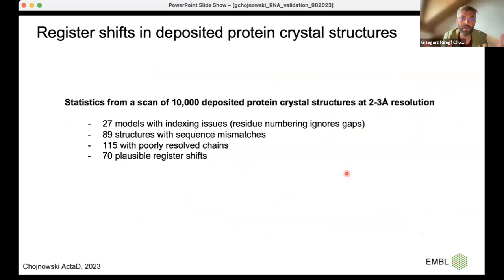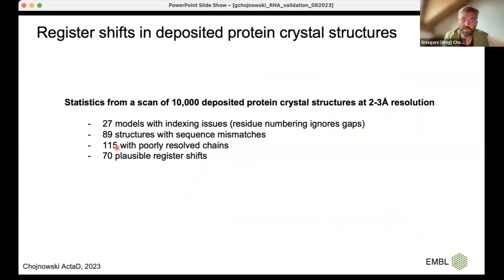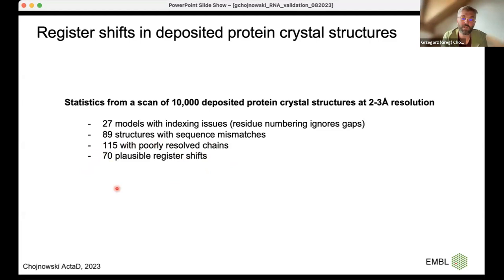A quick scan of protein structures between 2 and 3 Å resolution in PDB — the crème de la crème, the same ones used to train AlphaFold — reveals quite a lot of issues, including almost 1% of structures with very plausible register shifts. Even though 1% is small, these clear errors in the training set could be harmful for the future. Most can be addressed with AlphaFold-like tools. The presence of these errors in training data should be addressed.